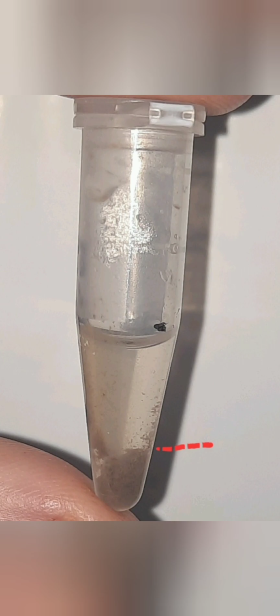The Eppendorf tube was then allowed to settle, or centrifuge, which forms precipitate of soil and liquid supernatants. For each slide, we sampled 50 microliters from immediately above the precipitate along that dotted line to collect the organisms that settle on the solid detritus.